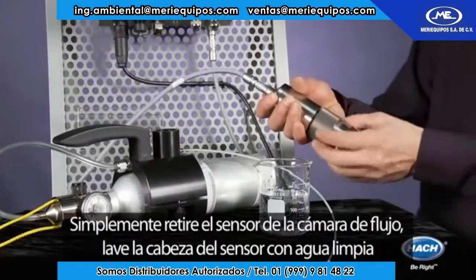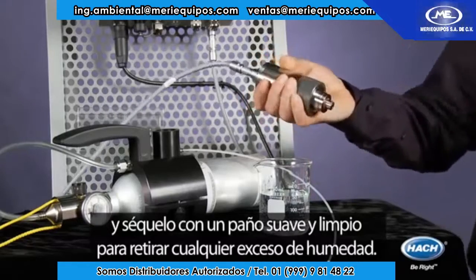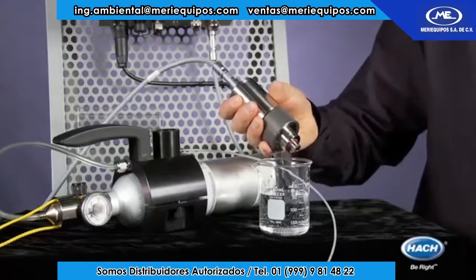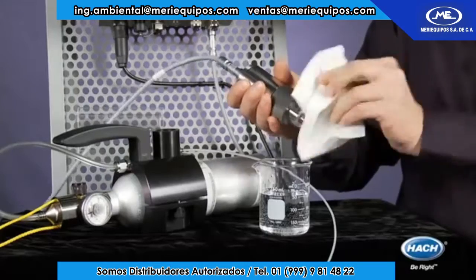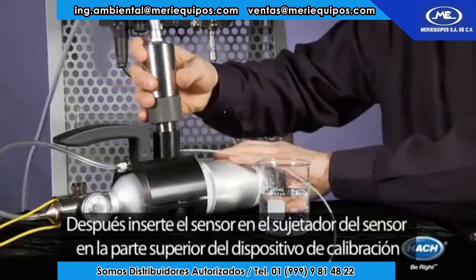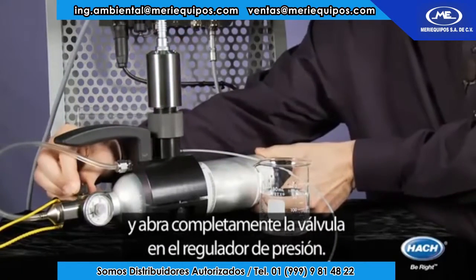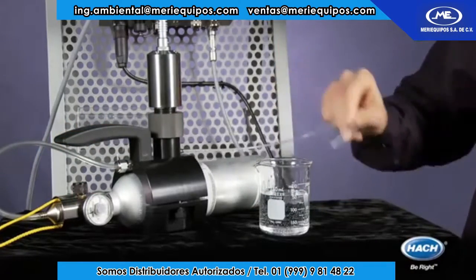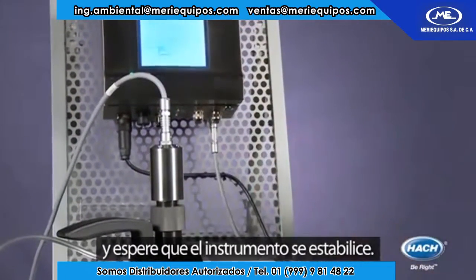You simply remove the sensor from the flow chamber, rinse the sensing head with clean water, and wipe with a clean soft tissue to remove any excess moisture. You then insert the sensor into the sensor holder on top of the calibration device and fully open the valve on the pressure reducer. Then simply hit start in the zero calibration menu and wait for the instrument to stabilize.